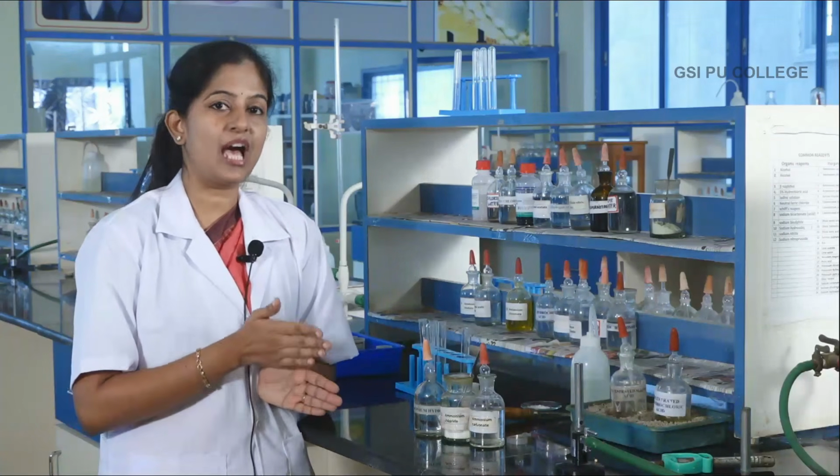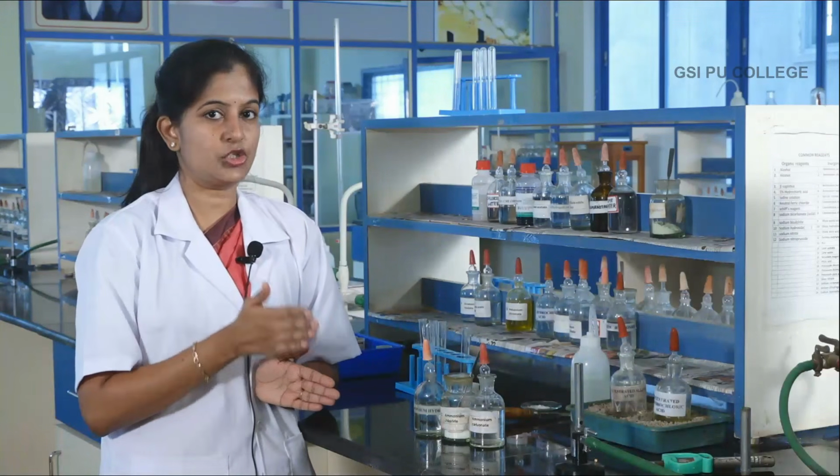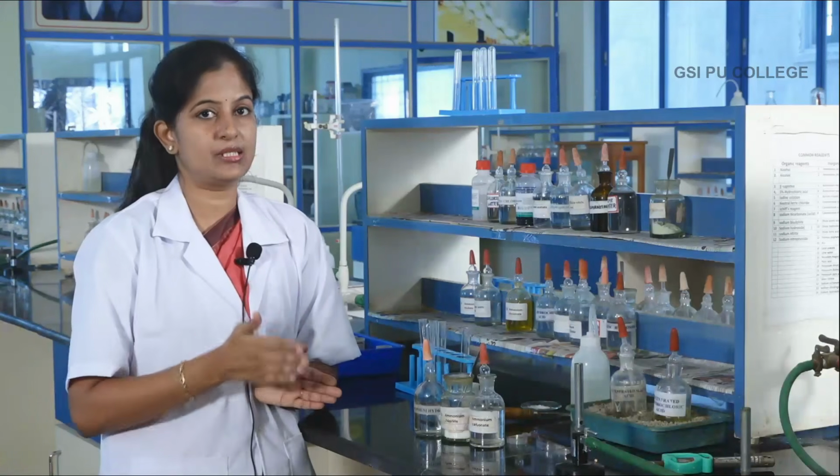So, this order must be maintained. So, after showing the absence test of one, you must go to the presence test of the next. That is, if barium is present, the test is stopped there itself. If it is absent, go for strontium. If it is absent, go for calcium. So, in this same order, show the absence test and go to the presence test.